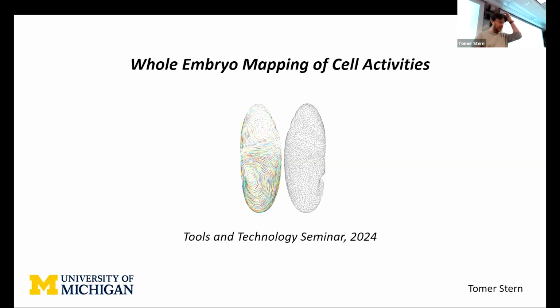My lab is interested in understanding how organisms form the shapes of their organs throughout their early development. We do that in two model organisms. One of them is the early fruit fly embryo that you will hear about today. The other one is the early embryonic development of the mouse. And we do that mainly by using and developing bioimage informatics tools to tease apart the complexity of live imaging data, as I'm going to show you today.